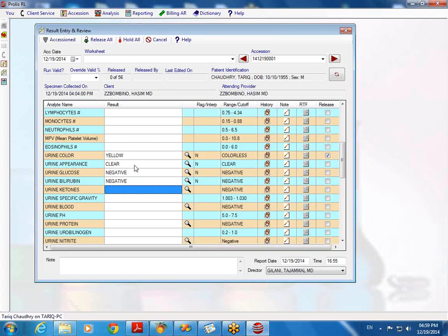So my response to your question is yes, we can do it via interface, more professionally. But if your question is whether we can accommodate you with some kind of custom arrangement, my answer would be no, because we keep developing the interfaces for various analyzers, like we did for the Nevada laboratory with LCMS.